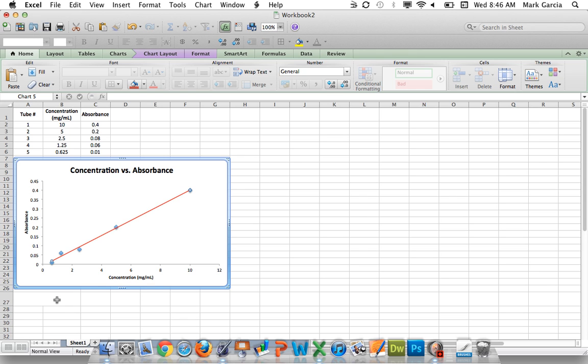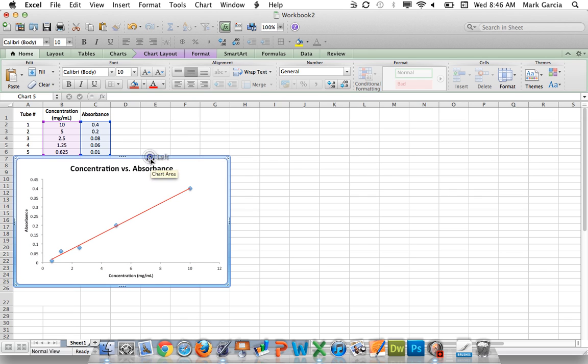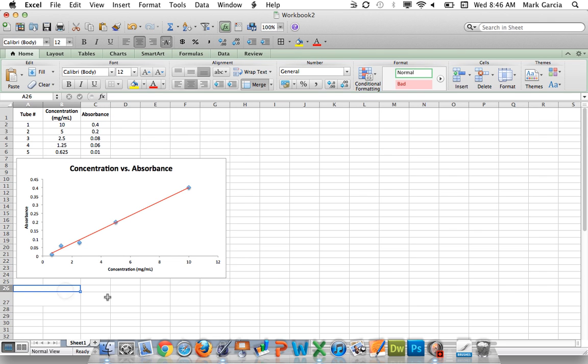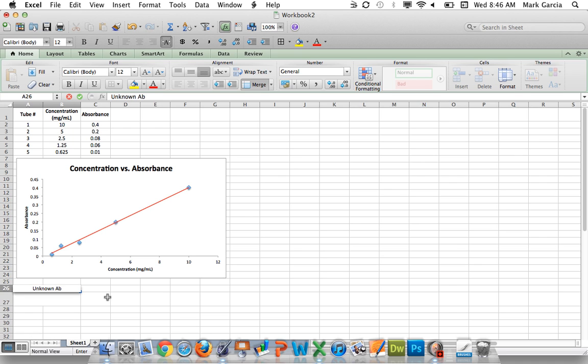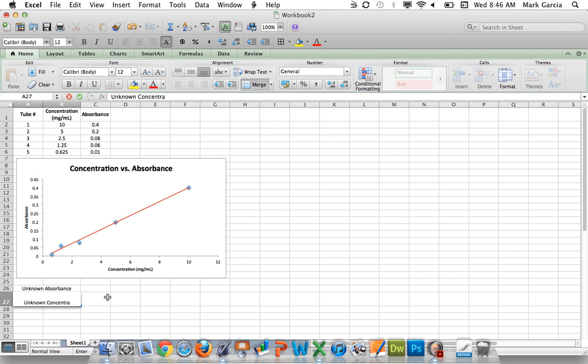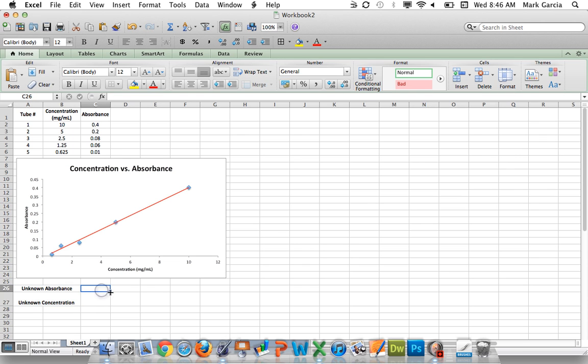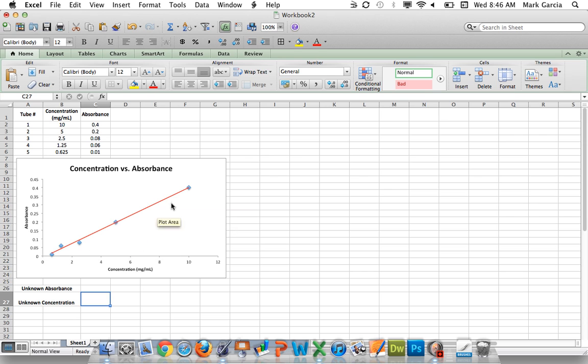Now what I want to do is I want to take this standard curve and I want to use it to help me calculate the concentration of an unknown sample. So let's say that I have an unknown absorbance and I want to calculate the unknown concentration. Let me bold these real quick. OK. So this is where I would type in my unknown absorbance. If I put my unknown tube into the spectrophotometer and it gave me some absorbance, that would give me that value. And I want this to use this information to then calculate the concentration based off of that absorbance.